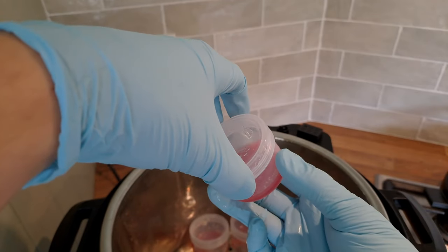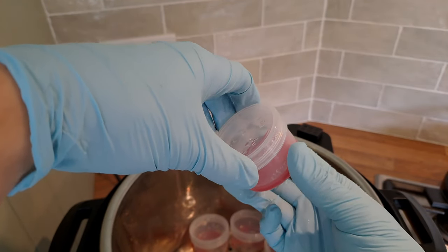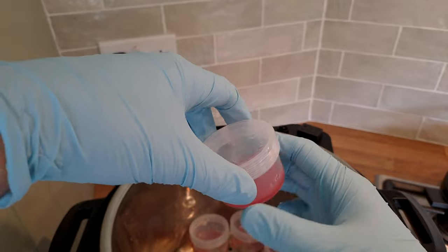Check all the pots just to make sure the lids are on tight before you remove them from the pressure cooker.